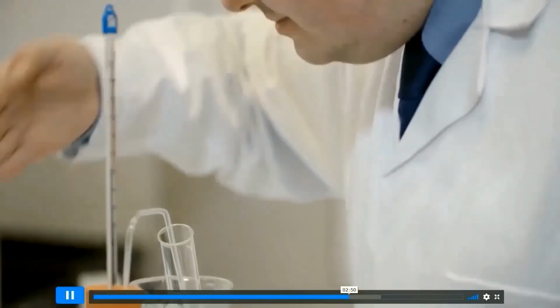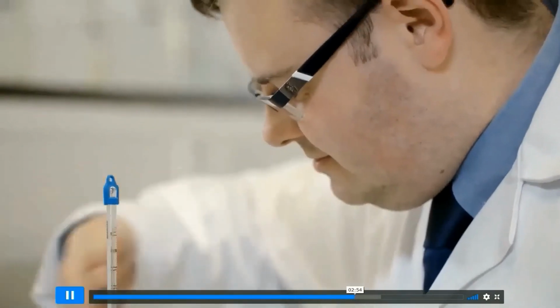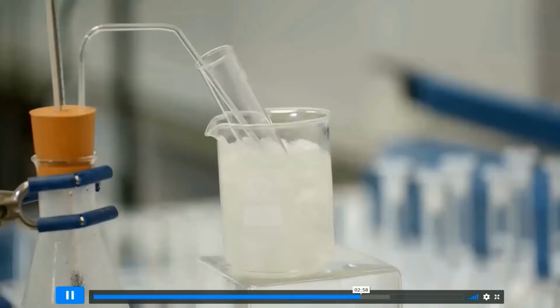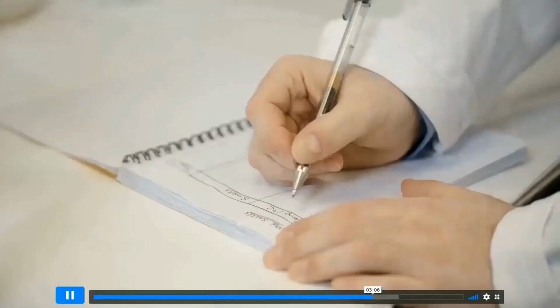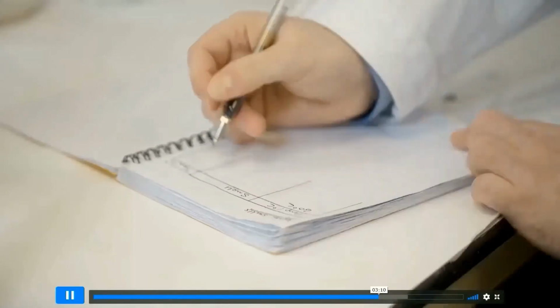The vapours are wafted towards the scientist. The vapours are hot and should not be directly inhaled. The vapours are the flavourings that are present in the carbonated drink. These food flavourings are esters and are low boiling point liquids. The time and the temperature is recorded when a specific smell is identified.